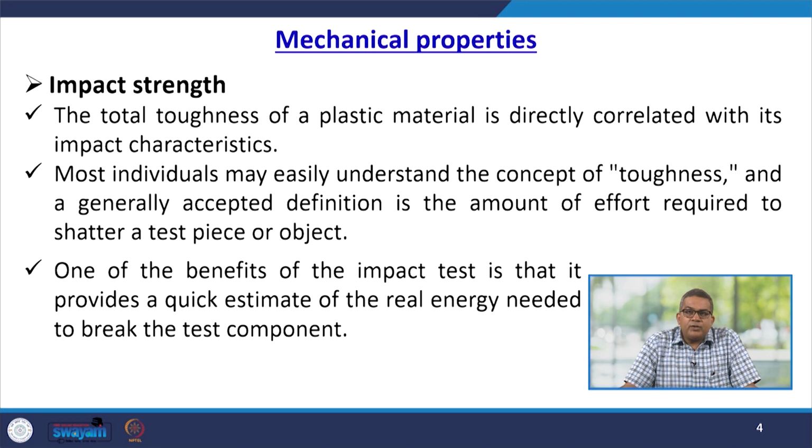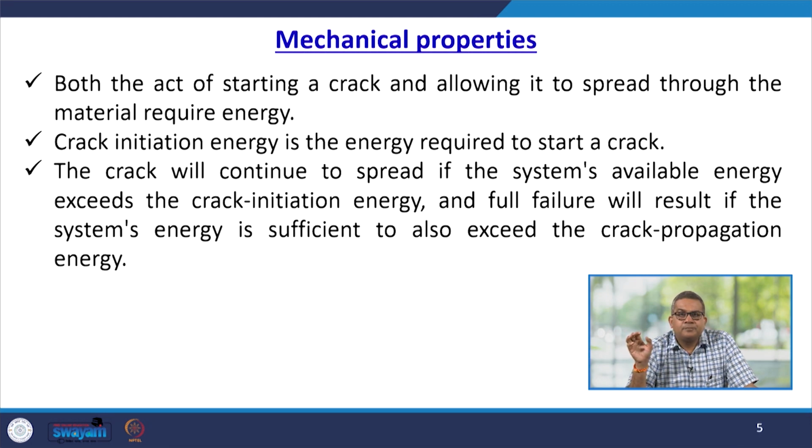Now, most individuals may easily understand the concept of toughness, and a generally accepted definition is the amount of effort required to shatter a test piece or object. One of the benefits of the impact test is that it provides a quick estimate of the real energy needed to break the test component. Both the acts of starting a crack and allowing it to spread through the material require energy.